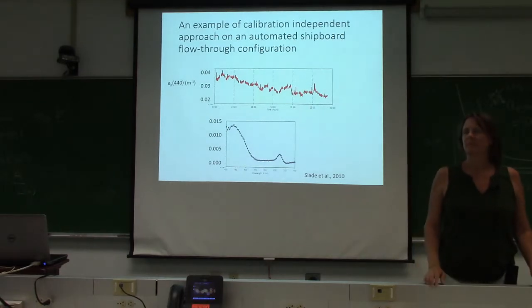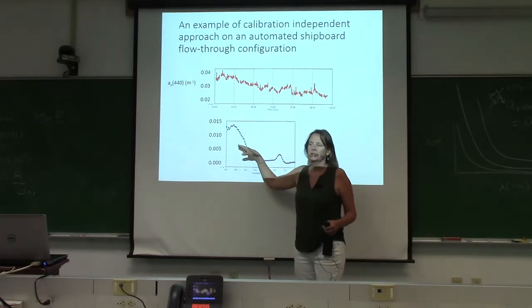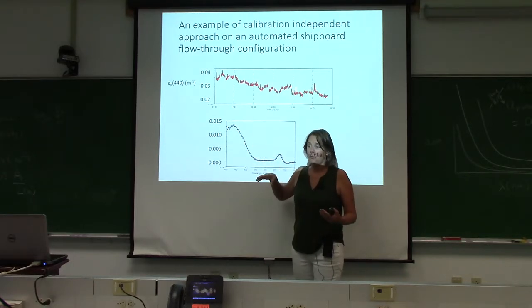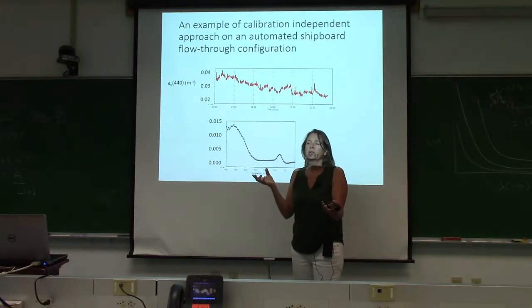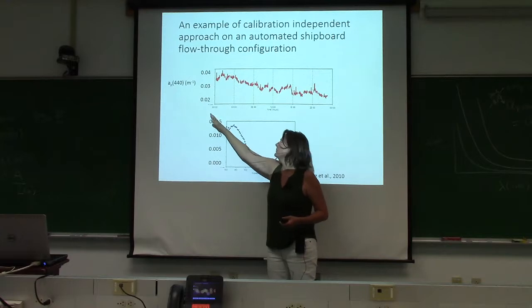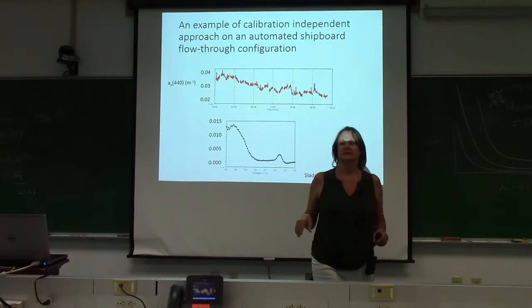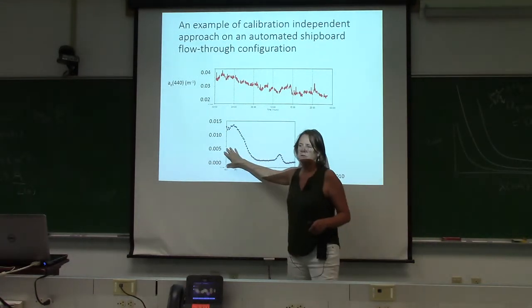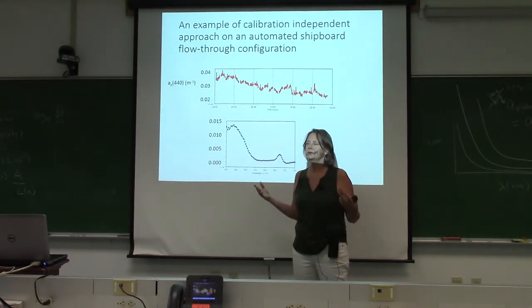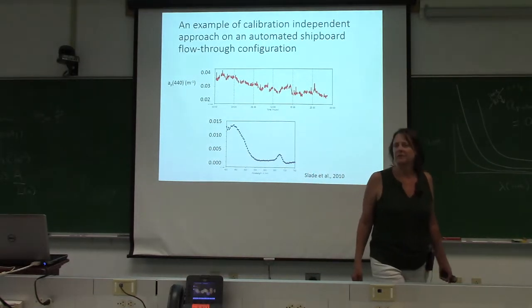What's the issue with passing it through an oxidizer? Well, what happens when you have pigments in here and you add a little bit of bleach, the molecules don't go away. They just change their molecular configuration. And it turns out they really start to absorb more in the UV, and then you get a tail end of what was a pigment. And so your non-algal particle is pretty garbage. You have to be really careful in the blue. So it'd be better if there was some way to, I don't know. I'm sure someone in this room will come up with a solution in the next 5 years.